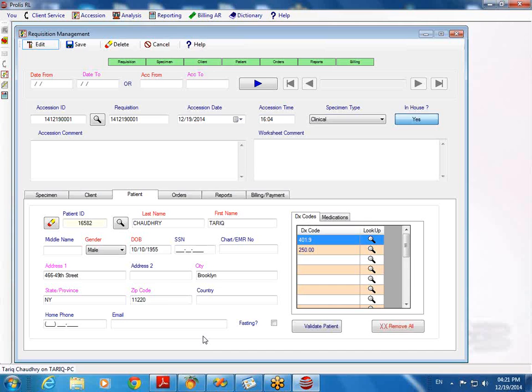Okay, because the thing is, we're not necessarily doing the pathology tests on the samples, but we require input of the pathology information before we do our tests. Okay. That is fine. I'm just using pathology as the example because it is more suitable for me to describe the situation to you, because the system has a capability to take the clinical information along with the specimen.